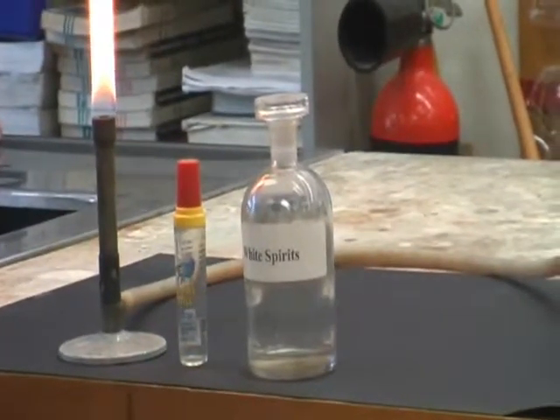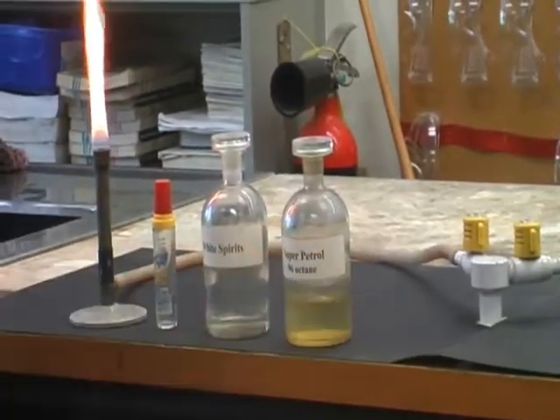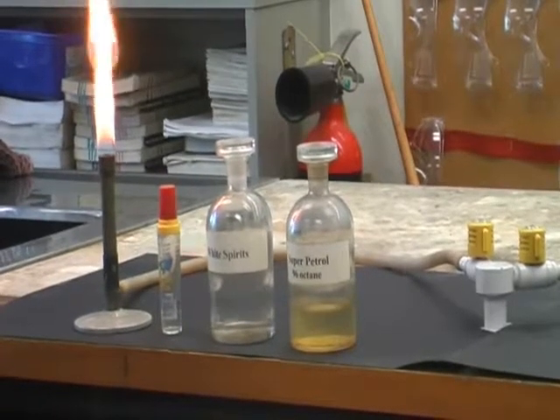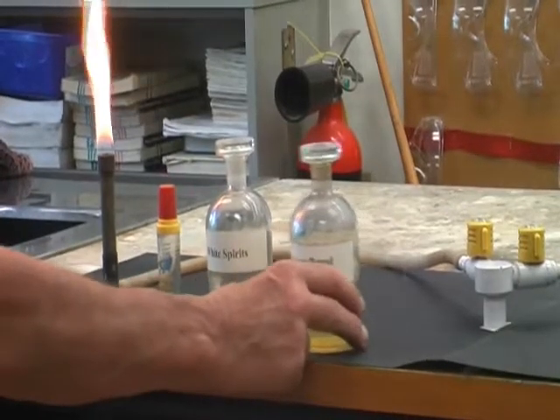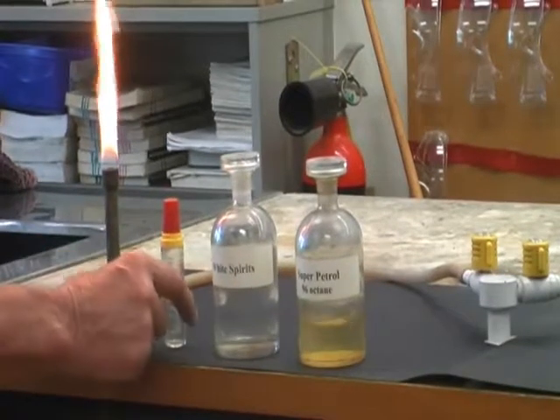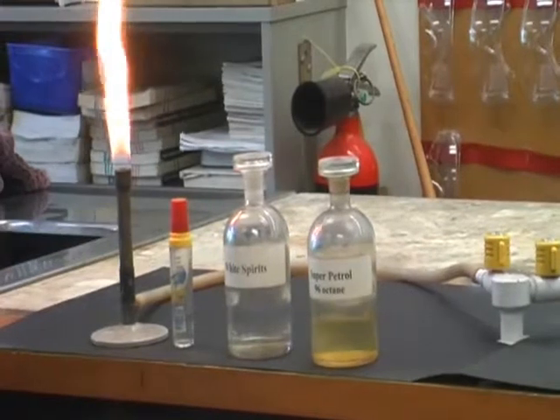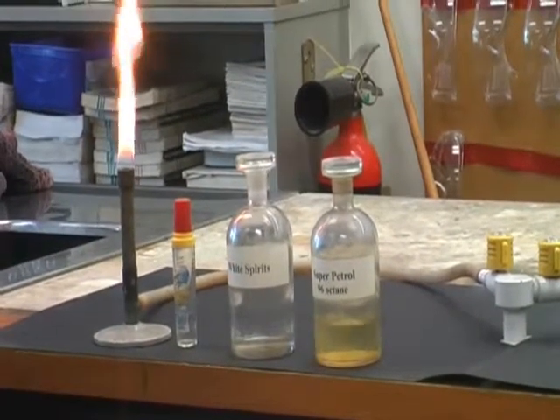Beyond that, we go to petrol, which may have various colours because of the additives. This one is called 96 octane and has 8 carbons approximately in the chain. And this has a little bit higher boiling point than this one. You'll notice that both of these do not need pressure, which this is a sealed pressure container. Now, once we go past that, we have other fuels where the carbon chain gets longer.